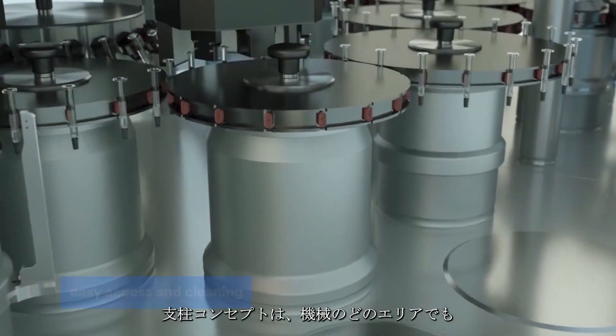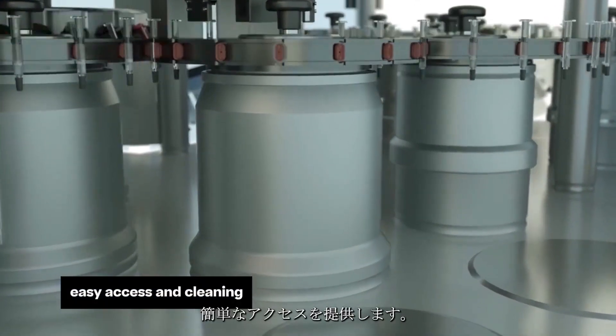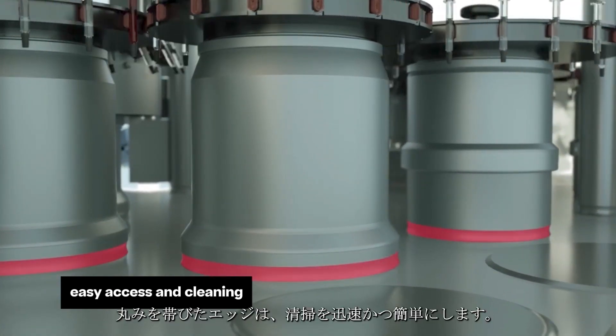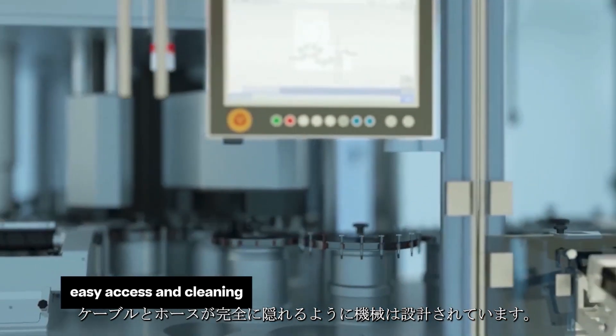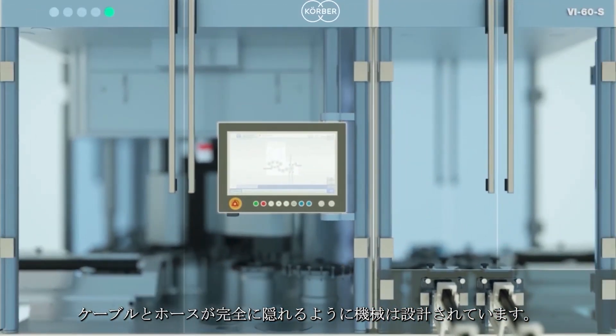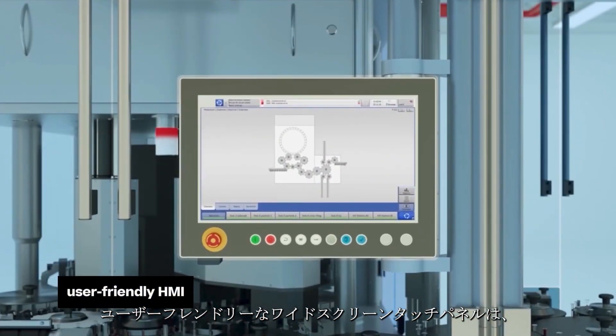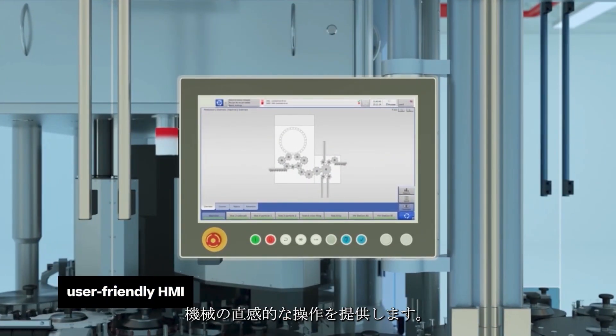The column concept provides easy access to all machine areas. Rounded edges enable quick and easy cleaning. The machine is designed to ensure that cables and hoses are entirely hidden. A user-friendly widescreen touch panel offers intuitive operation of the machine.